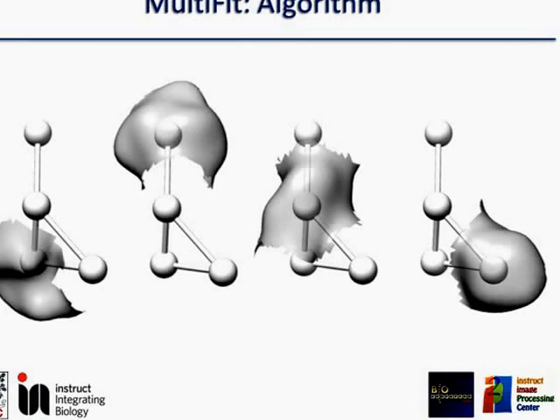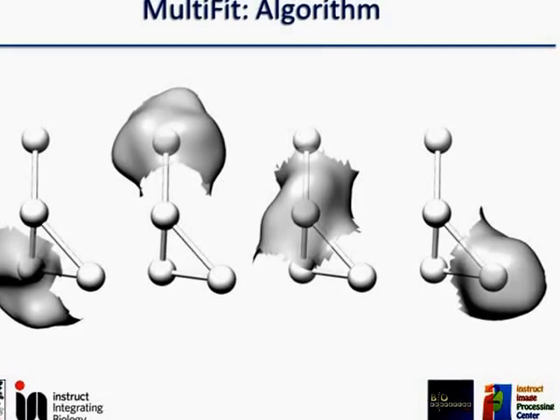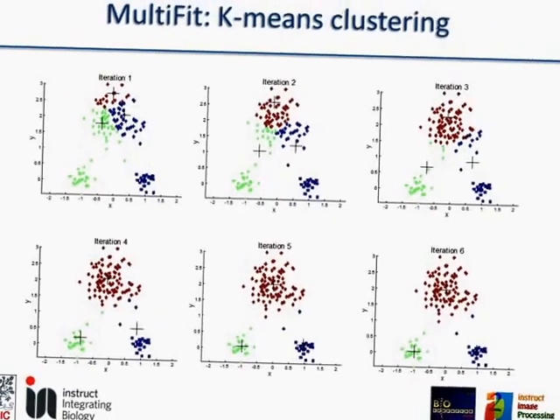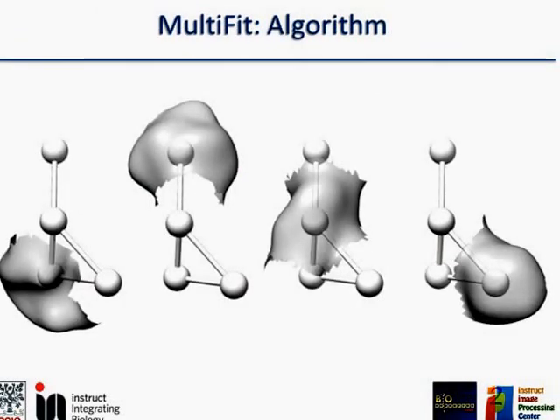Multifit is exactly the same. Okay, this is not real. I just erased the volume so I can show a bit, but the principle is the same. These points of my volume are closer to this point here, and these points of my volume are closer to this point here. And the edges of the graph, it's because here we have a discrete set of points, but in the volume, these points are connected.